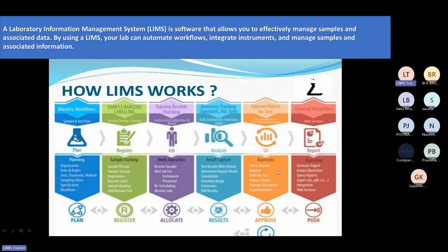Then comes the external integration. Suppose we need to share that particular data with another laboratory, or we need to share that data with the regulatory side. That's where the LIMS software helps. So all our work becomes easier with the software.